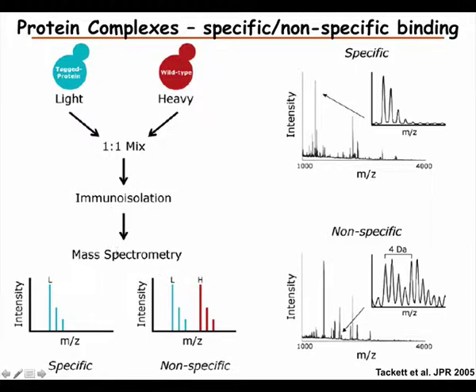These will tend towards the non-specific, so fast exchange will look like non-specific, and you lose those. But what that means is that this is a conservative method. The ones that actually turn out to look specific really are specific, but you lose some of them, the fast exchangers.